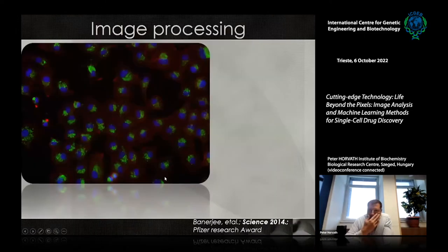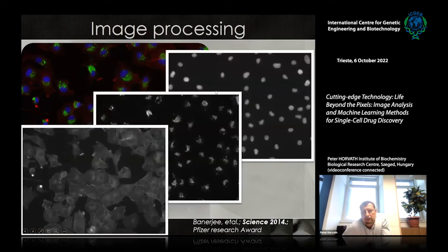Okay, so say we have flat images. The next step is to use these flat images for quantitative analysis. My group usually works on fluorescence images, but we also work a lot on other types of images. If it's about fluorescence, the image usually consists of different fluorescent channels, like DAPI staining the nuclei. In the next couple of slides I will show you an experiment where we were interested in the infection of the influenza virus under different conditions, and the cytoplasm.